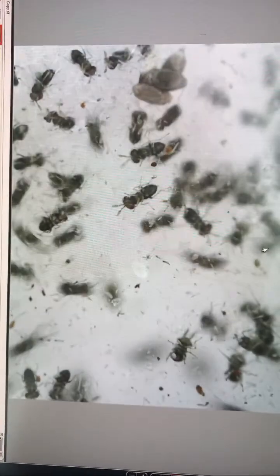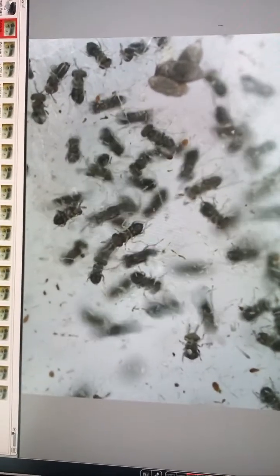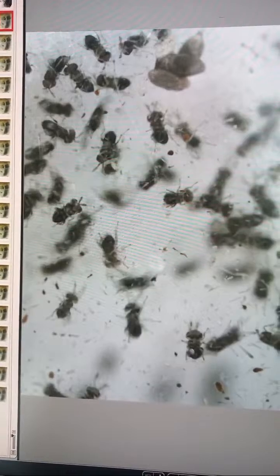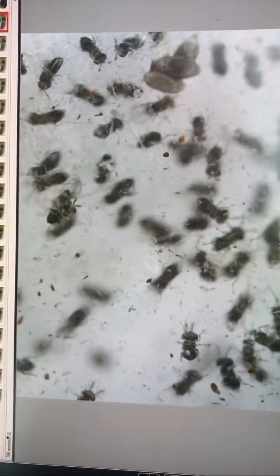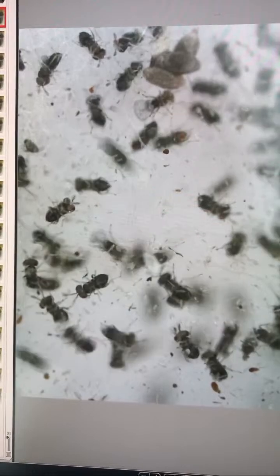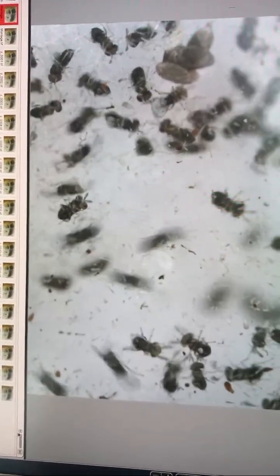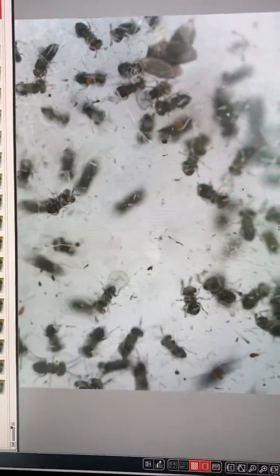I can decrease a little bit magnification so you can see many of them. Usually if I can show them just in a petri dish, in a glass tube, they're extremely tiny. 0.5 millimeter, this is a dot in a book, half of black dot in a book. So this is the size of these insects, 0.5 millimeter. They are not the smallest, but they are some of the smallest. Smallest egg parasitoids, these are parasitoids of thrips, belonging to genus Megaphragma, same family Trichogrammatidae. But Trichogramma is also very tiny.